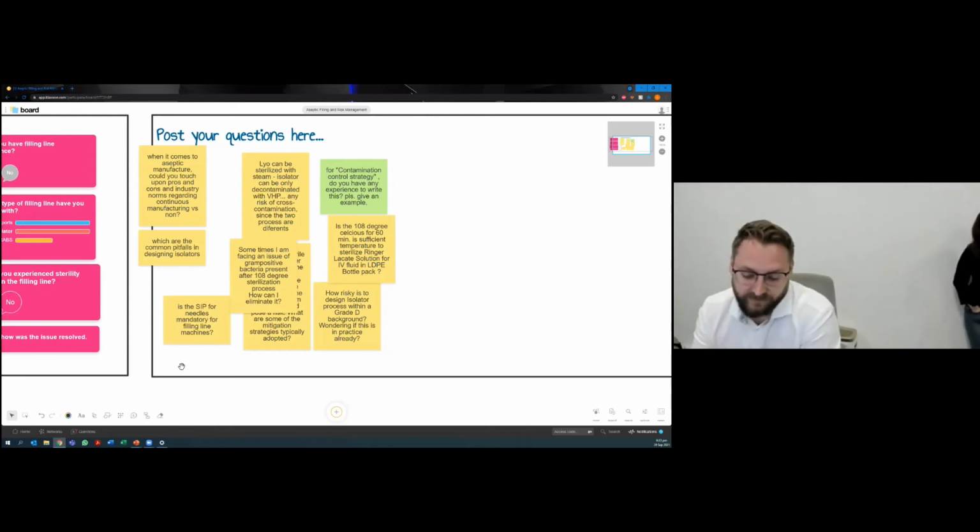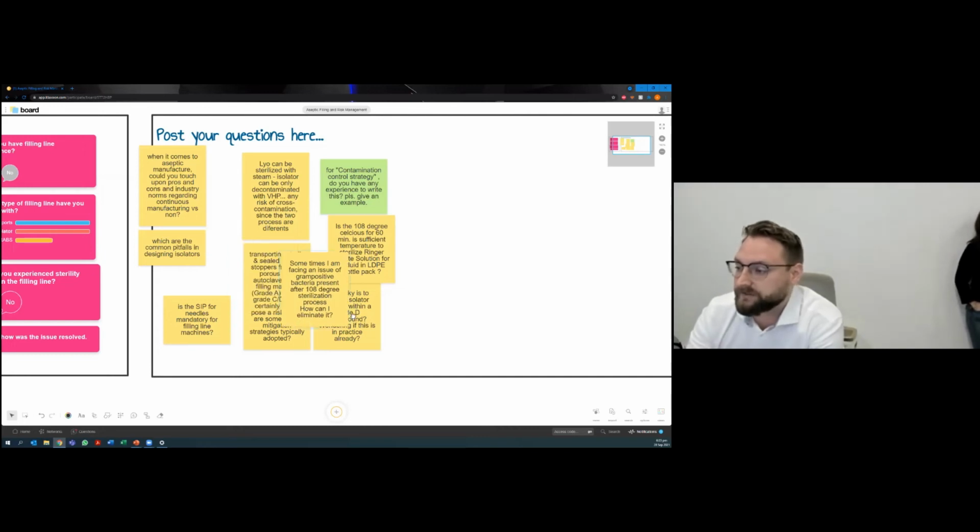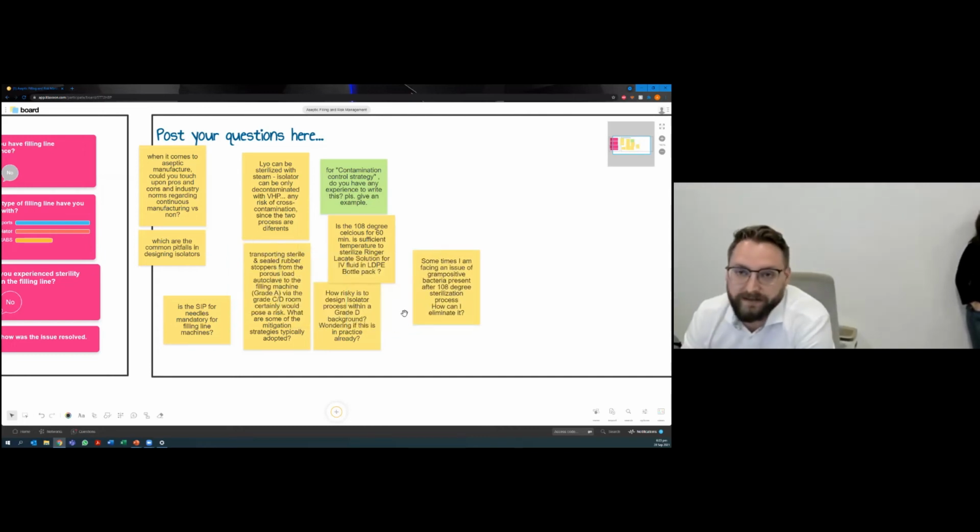Yes, and that's definitely, I think, kind of how the industry is trending. During the qualification and validation, you have to prove that the interior temperature within that needle reaches whatever your criteria is for sterilization for your time and temperature. So during the validation, you would have to use thermocouples inside the needles to ensure it does meet those requirements.